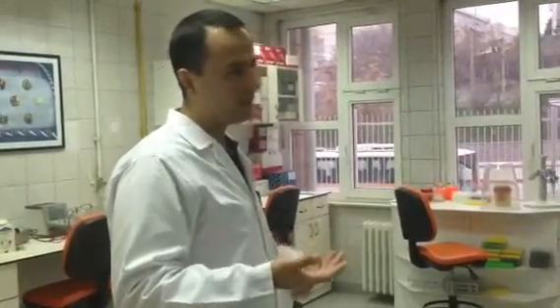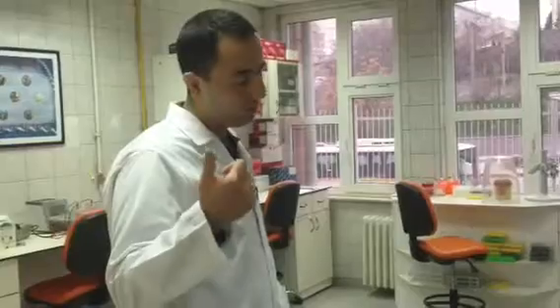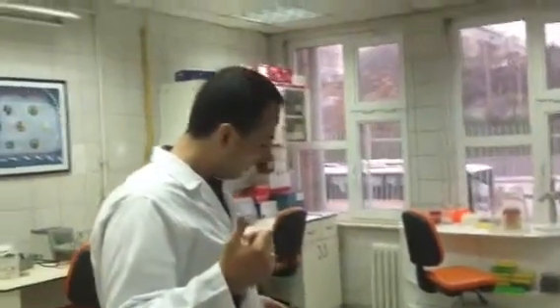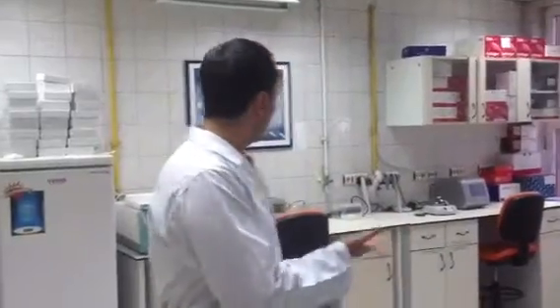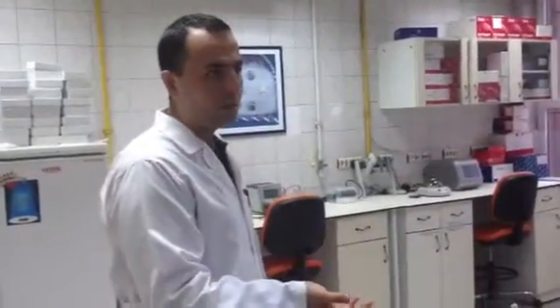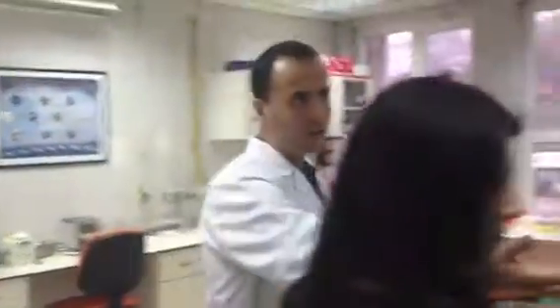The DNA extraction is in the viruses laboratory, and the samples are in the laboratory, and we make sequence analysis, and there are a lot of machines in the laboratory, coolers, different kinds of storage.